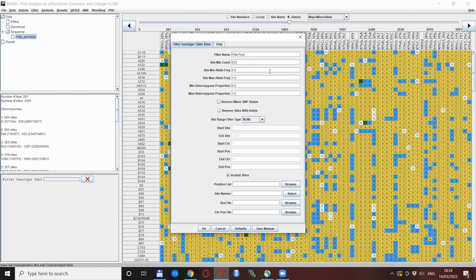Now, the second thing that is normally checked for, depending of course on what kind of analysis you do, and I talked about this multiple times in the Genomics Bootcamp videos. It's not necessary that you do all kinds of quality controls, quality checks and filtering processes all the time. You have to be aware what kind of analysis you are doing. So by no means am I saying that you need to fill all of these columns and filter for everything. But this video is about looking at all the opportunities, so we will look through these most frequently done things anyway.